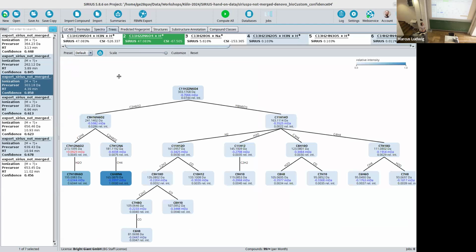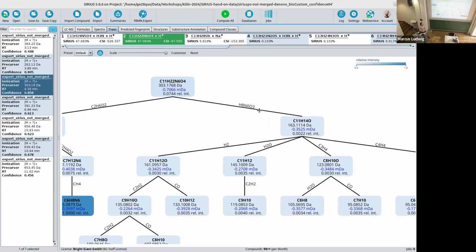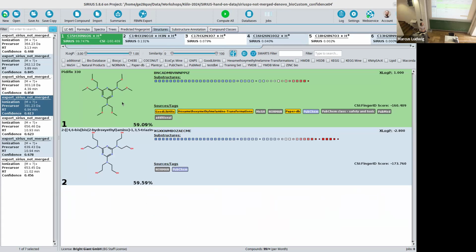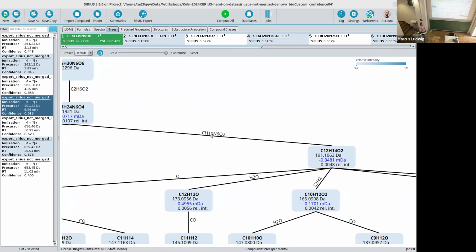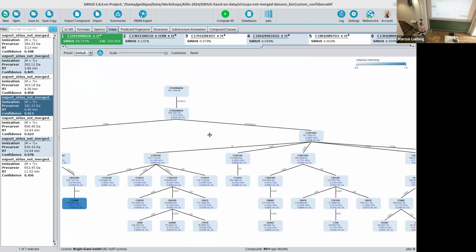But interestingly, if you have some time to look into this: for me, this loss seems strange, but if we look at our main structure we are interested in, it seems that this one is also producing something like that. So there are some similarities, such as this loss of a lot of nitrogen with only one carbon. So this is basically biochemistry knowledge you can maybe infer here or use to make sense of the data.